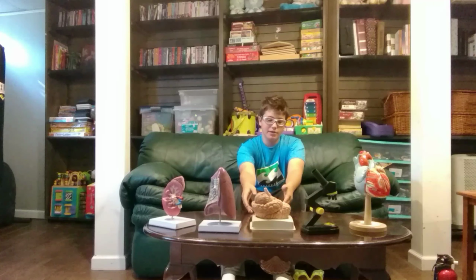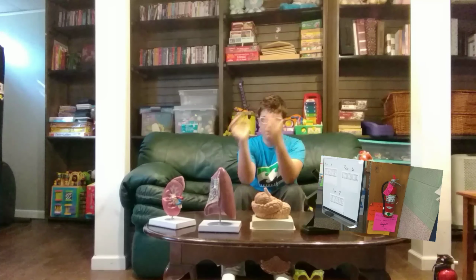Today we're going to be learning about the lab safety rules of science class. These things involve the fire extinguisher, the fire blanket, safety goggles, and the eye wash. We're going to be covering all of these things today in this class. So let's go do that.